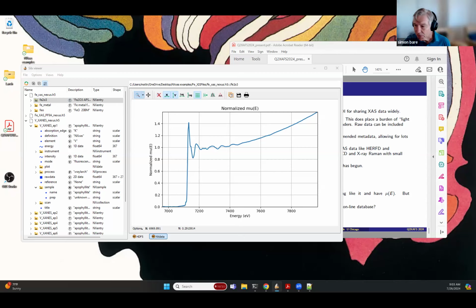Okay, there are no further questions in the chat, Matt. Can I ask one last question? Oh, of course, go ahead. What about the sizes of the files? Like we were talking earlier about fluorescence data, and if you go, for example, a 36 element detector, you got 36 MCA for each detector, and all those data. Will there be a limit on the file size for portability / readability purpose, or is the file as big as it needed to be?